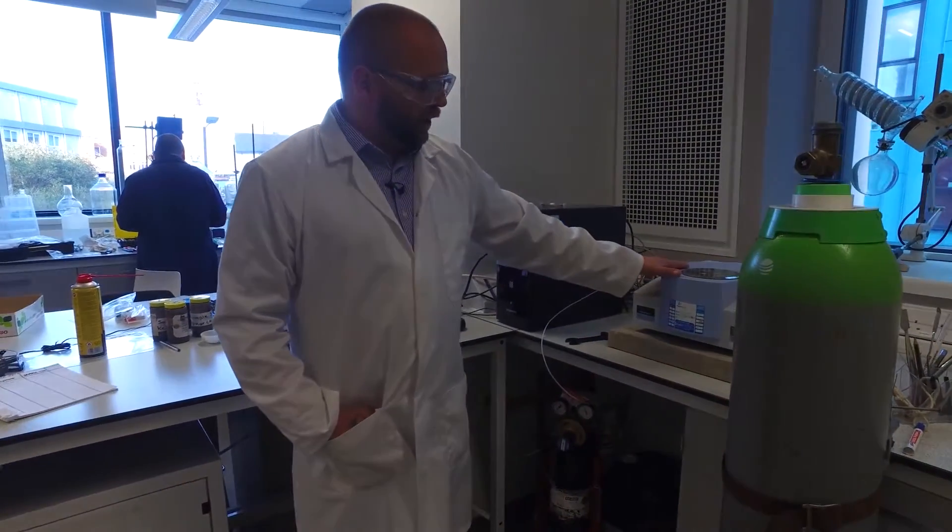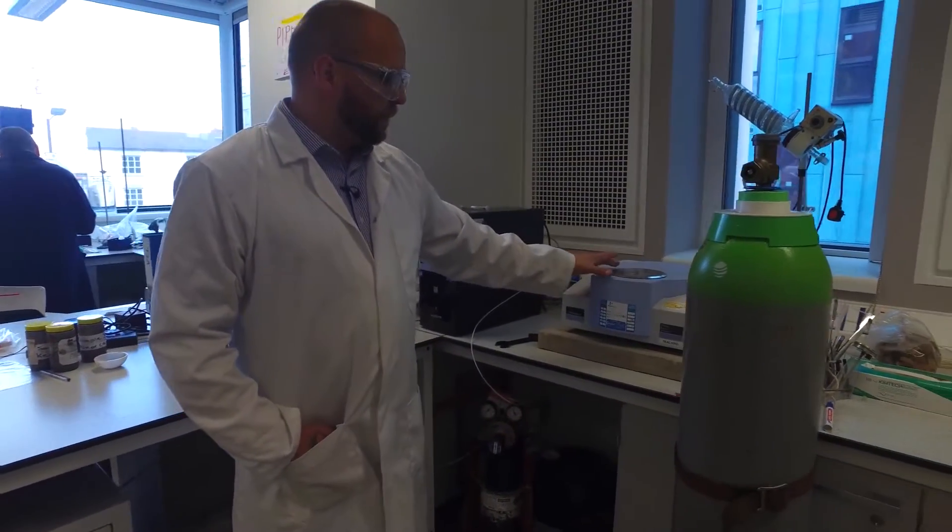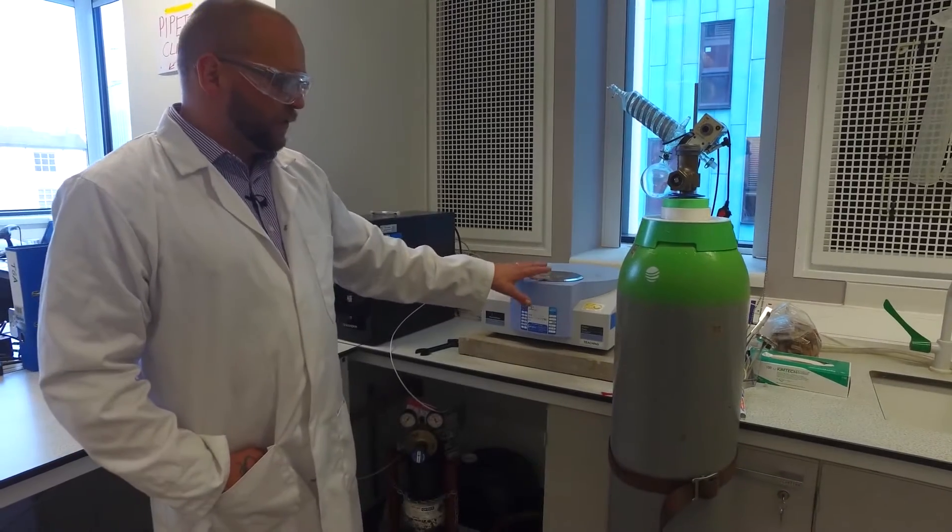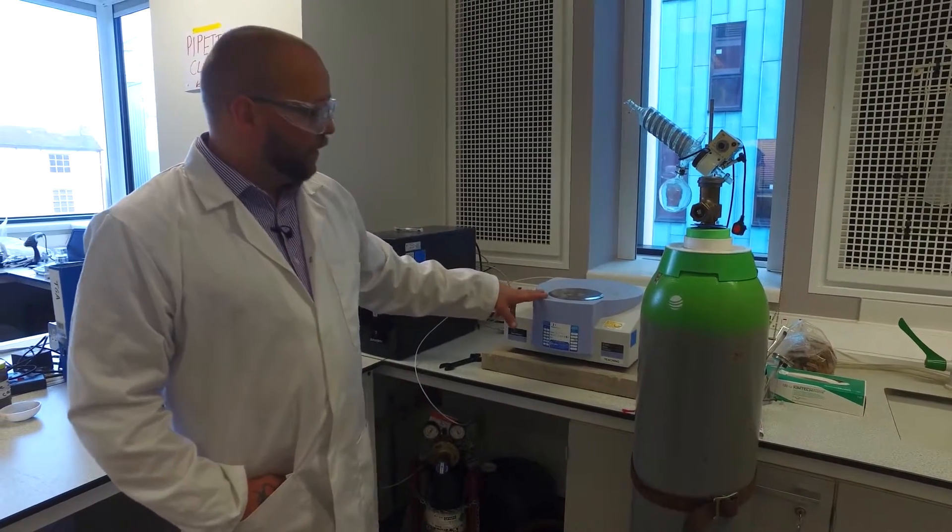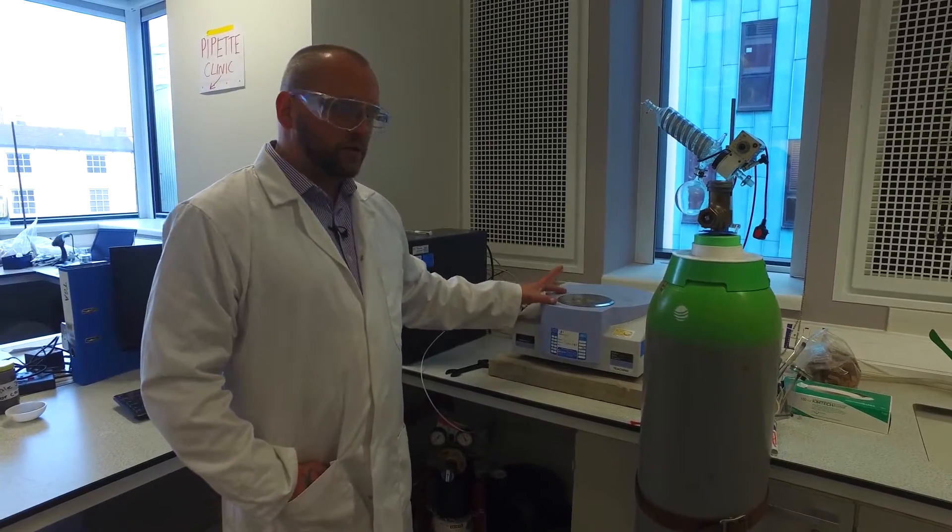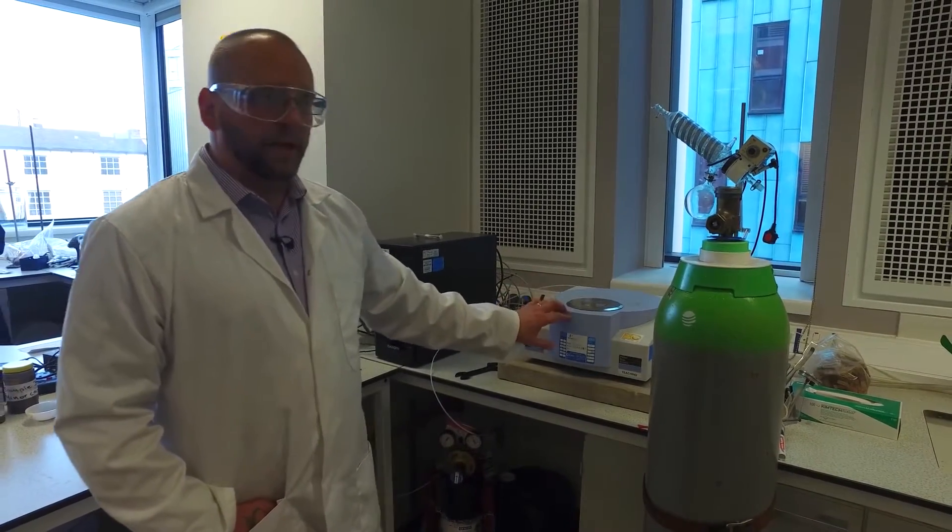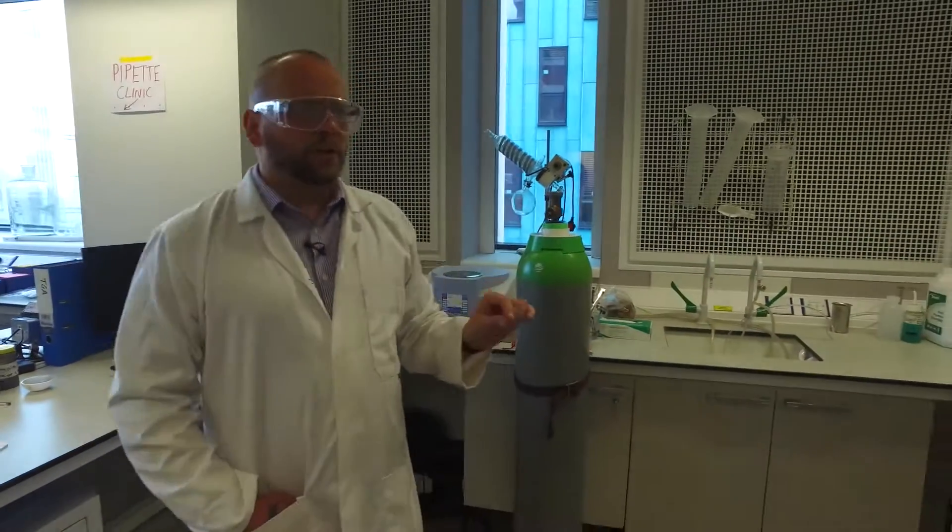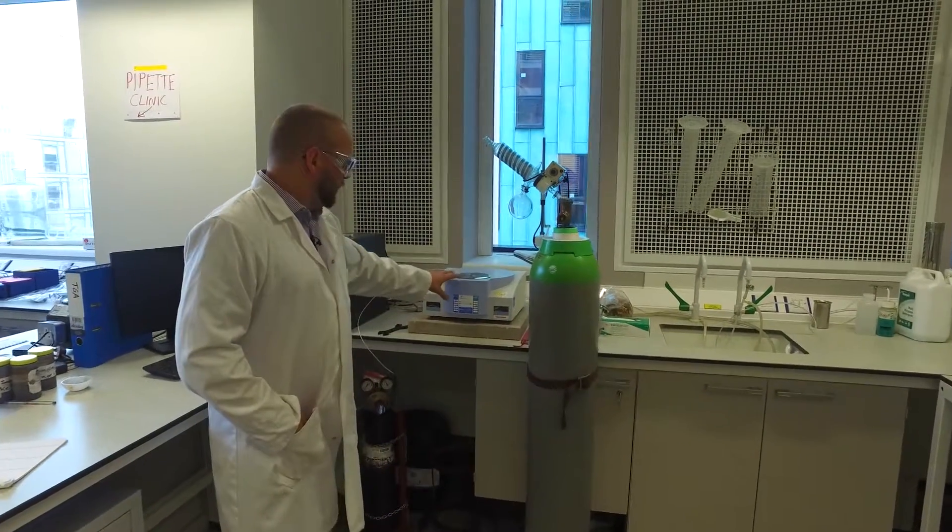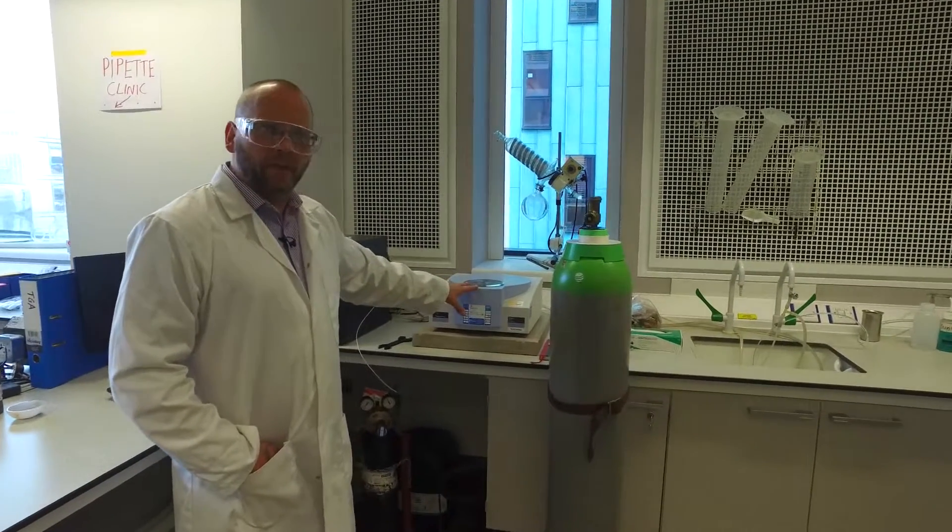What this follows is as you increase the temperature of your sample in here, you follow the mass loss. From the mass loss of your sample coupled with the energy output, you can get a real solid handle on how good a fuel you've managed to generate.